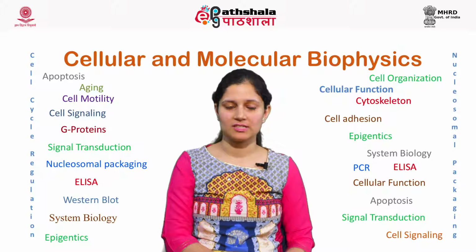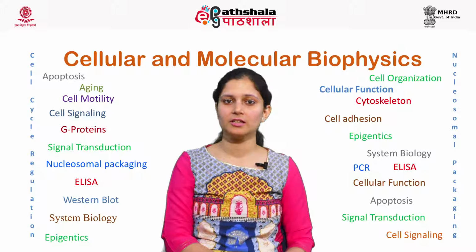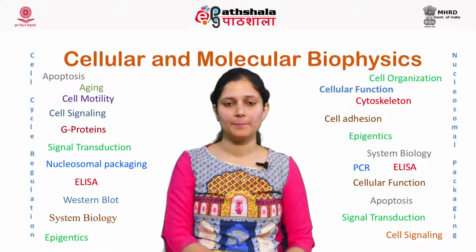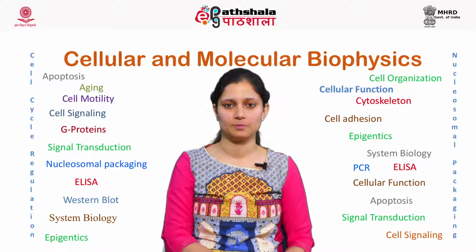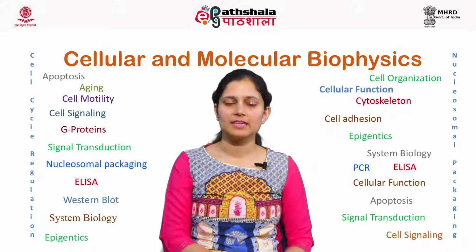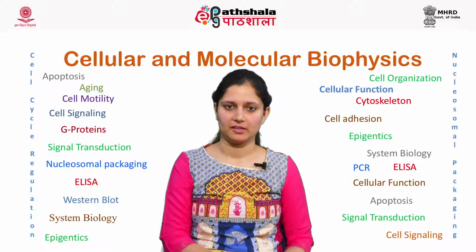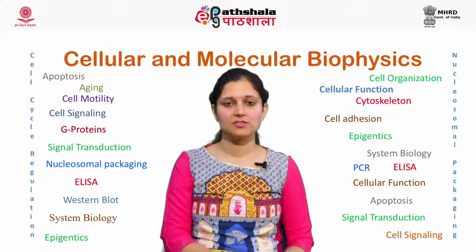Polymerase chain reaction is an enzymatic method of amplifying a particular sequence of DNA many folds in vitro. That is, this amplification takes place outside, in a test tube. As we can generate millions of copies of DNA, this technique is very useful for molecular diagnostics, forensic science and in medical research such as cancer research and drug discovery.